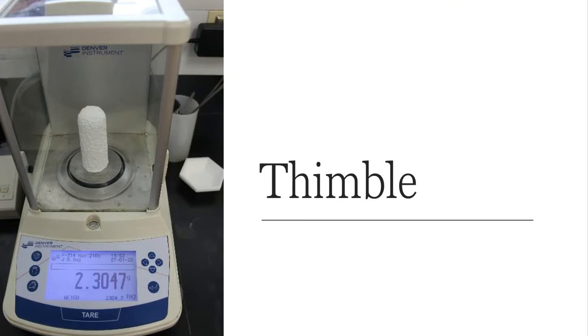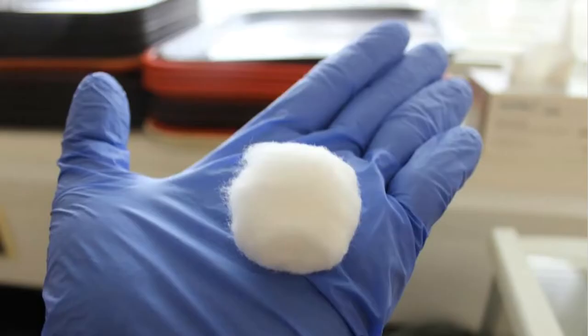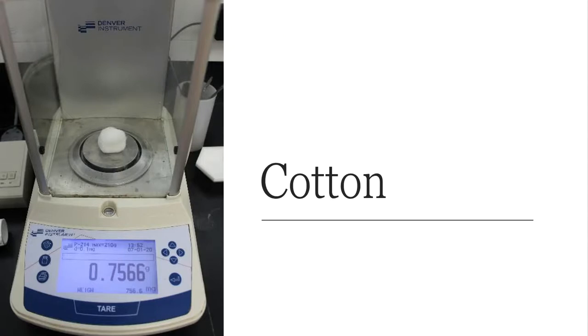Well, I also like to have a little top, a little cap onto my thimble. And the reason that I do this is to prevent stuff from floating up and out. If I'm going to take the time to do a thimble just to ensure that things do not get lodged up into the extractor, then I want to make sure that I take the time to put a cap on it so little small particulate pieces do not float up and out of the Soxhlet thimble. All right, so that's the purpose of the cotton. I'm going to end up putting the cotton in the thimble at a certain point. So I need the mass of the cotton too. So the mass of the cotton, 0.7566 grams. Well, as you can imagine, all of these pieces have to be connected.